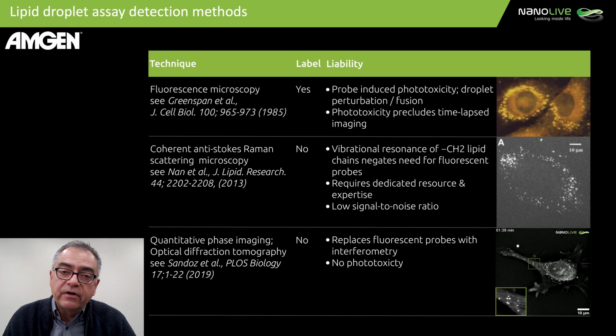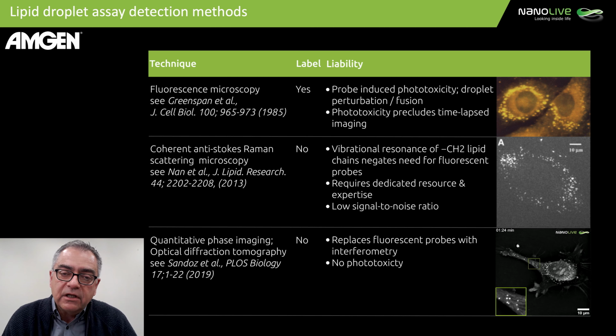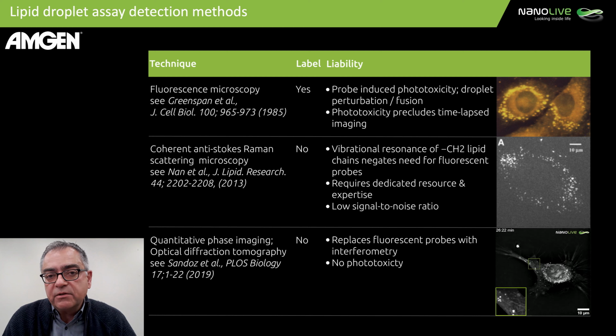Most recently, label-free approaches have really excited me, all the way to the extent that this has really become part of my 5-year strategic plan for the laboratory. This is because probe use is not benign. And with the topic of lipids in particular, we know that the introduction of probes can create artifacts not only with the dynamics of lipids within a living cell, but they can also induce phototoxicity if one is interested in obtaining time-lapsed studies.